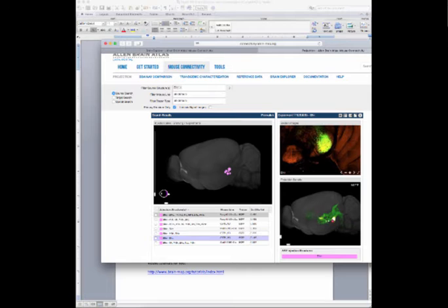And then it's spanning out to all these different areas of the brain, which you can see the tracers labeled with this fluorescent green label on it. We'll also get a picture of some coronal sections of the mouse brain. If we zoom out a little bit, we have a coronal section that's pretty far posterior into the brainstem.